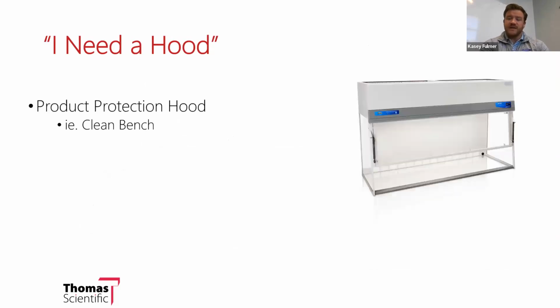I know that people work in clean benches and they call them hoods. Clean benches only provide product protection. So if you were to send a clean stream of air from the back of the unit towards the front, just making sure that whatever's on the inside remains uncontaminated, and all of that is pushed towards the user, it needs to be non-hazardous. So it's only providing protection for what's on the inside, not for the user.